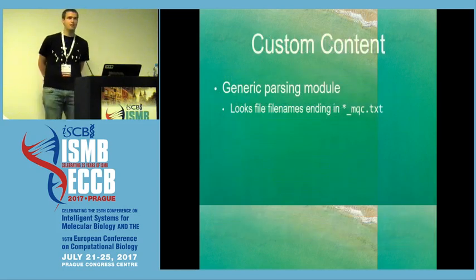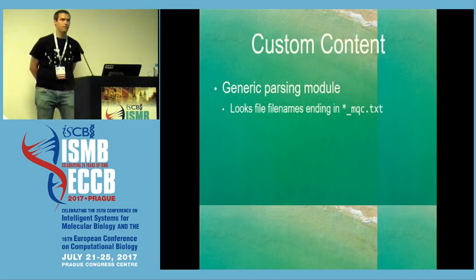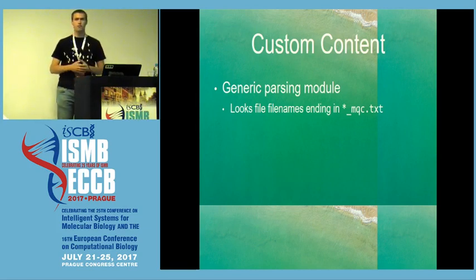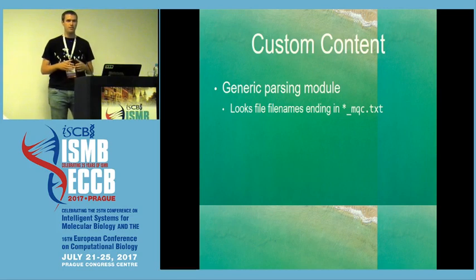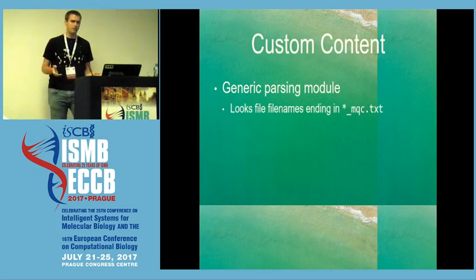One relatively recent addition to MultiQC is what I've called the custom content module. This is designed for groups where you might have your own pipelines or your own custom scripts which generate analysis results, but it's only ever in your lab, so it's not something that you want to write a module for and go to a lot of work, and it would never be published for the main MultiQC program because no one else could use it.